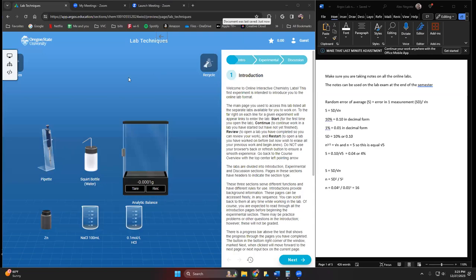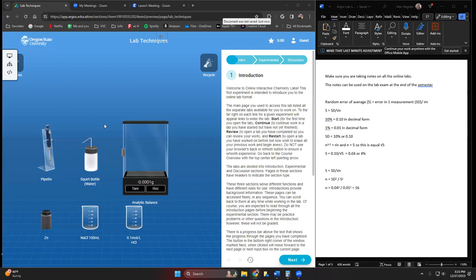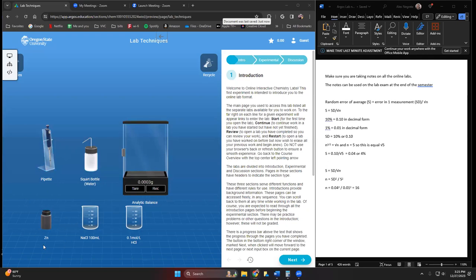This is going to cover the lab techniques video on Argos education. Lab techniques is basically just learning how to maneuver around the online lab environment. Everything's labeled here: analytical balance, square bottle, pipette, reagent bottle where we have our solutions and chemicals.